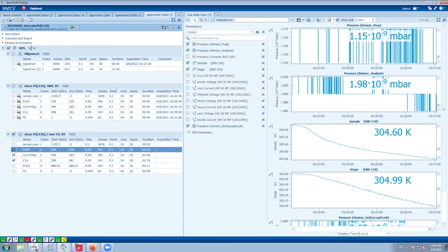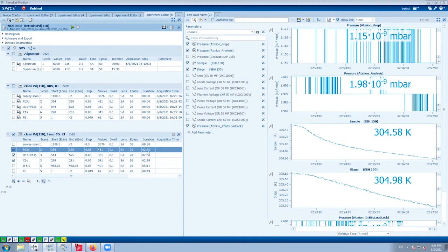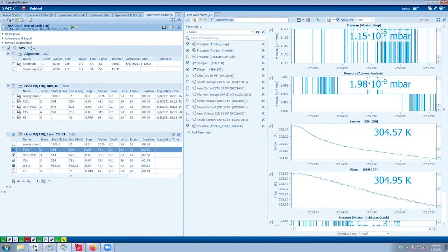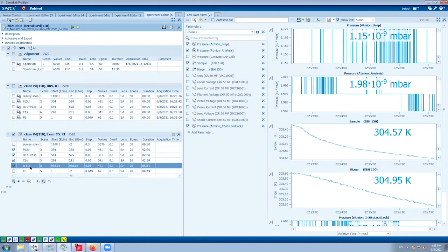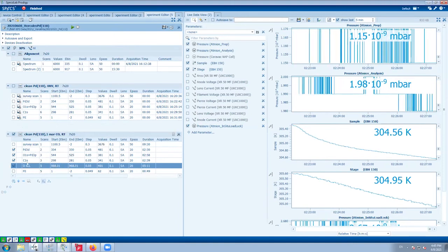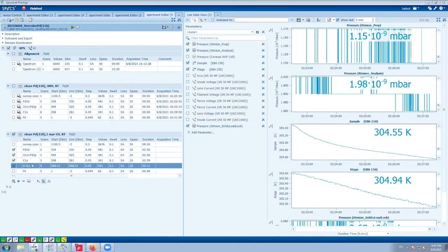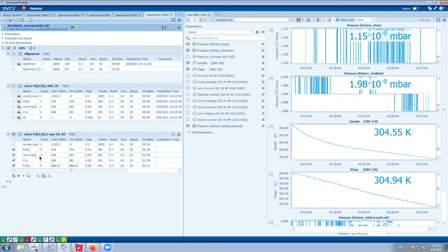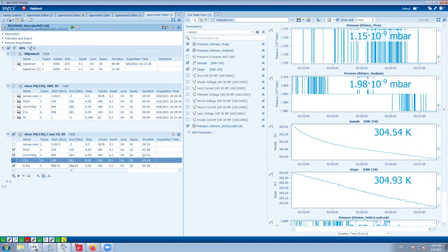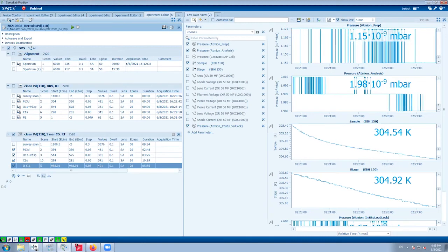Well, you can see there a little bit maybe the spectral field. So this will take around, let's say, less than 10 minutes. Plus to see, okay. You can do the whole measurement. How much is it? 5 minutes. I'm not sure about this region. So maybe we can also remove something and increase a bit the scans for carbon, 10. Okay.